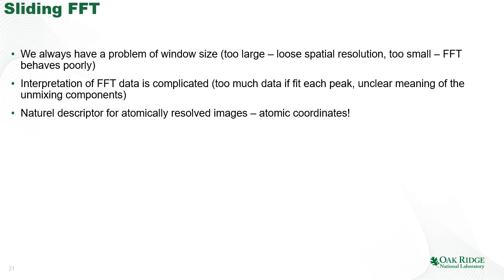Now, what are the limitations of the sliding Fourier transform? So the first limitation is that we always have a problem of how to choose the window size. If we choose our tile too large, then we lose spatial resolution. So the windows start to overlap, and we don't really learn much. At the same time, if our window size is too small, then the Fourier transforms start to behave poorly because of the edge effect. So we really cannot perform the Fourier transform if we have only a few unit cells inside the tile window and expect to have a good answer.